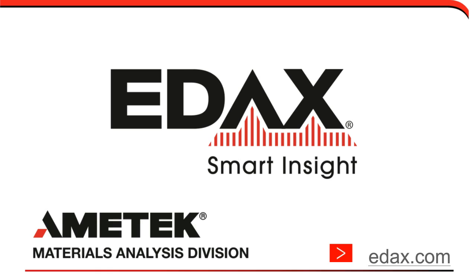It piggybacks into OIM Analysis, where we'll collect and save the patterns within APEX, but the dictionary indexing is designed to work offline, not as live indexing. There's actually a webinar from sometime in the summer by Dr. Stuart Wright, where he went over some of the dictionary indexing functionality. So that will be coming along as well.